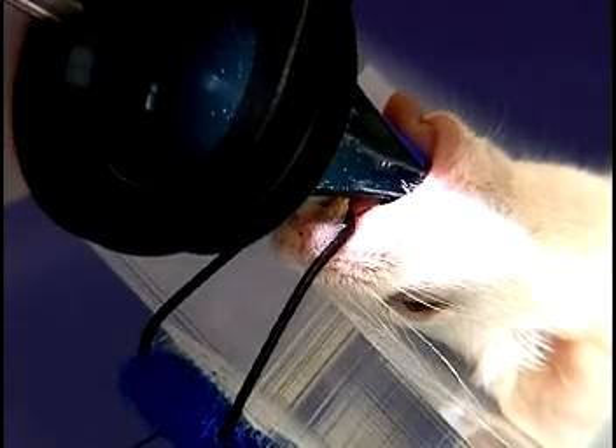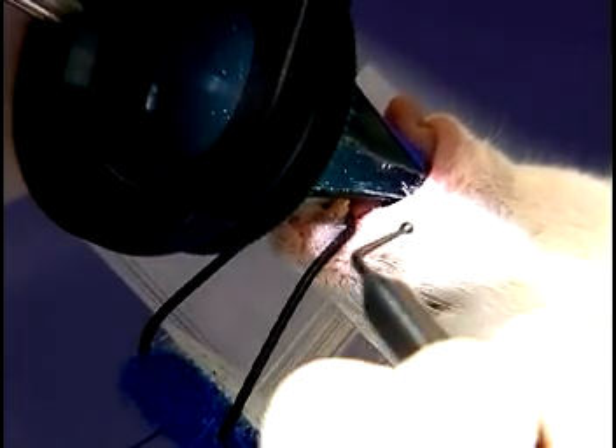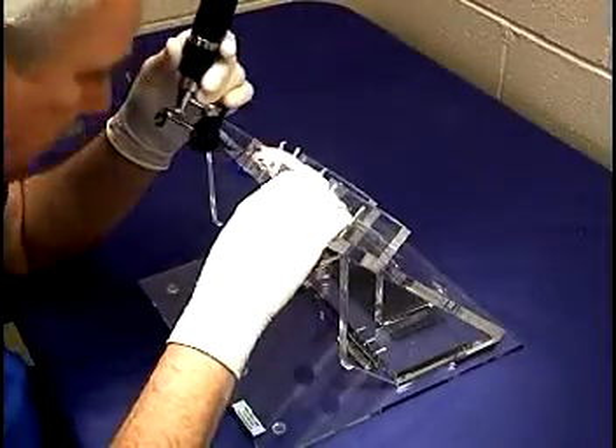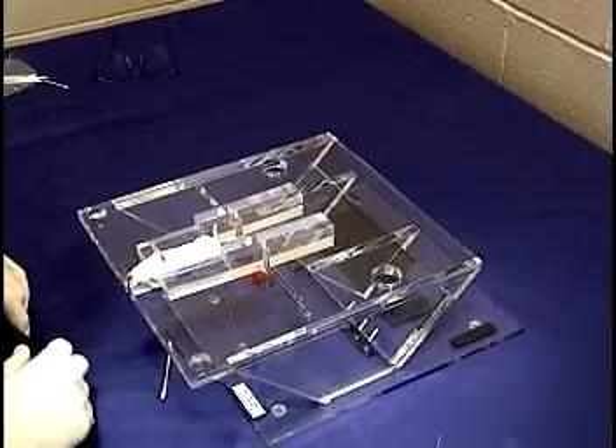Once an adequate view is obtained, the applicator is dipped into the lidocaine jelly and very lightly coated, then inserted from the side at the corner of the mouth. The jelly is applied to the cords, as shown, and the stand is lowered briefly while the lidocaine takes effect.